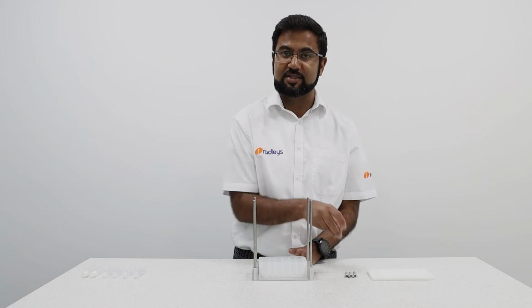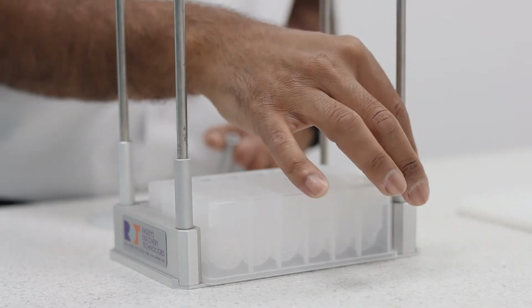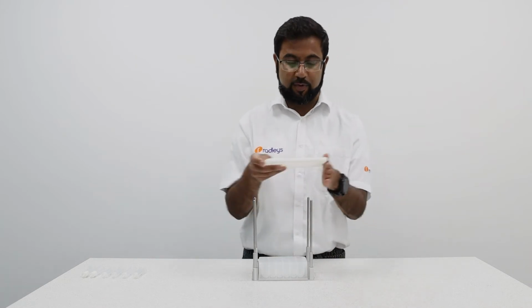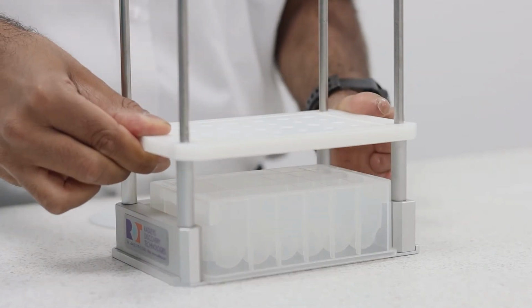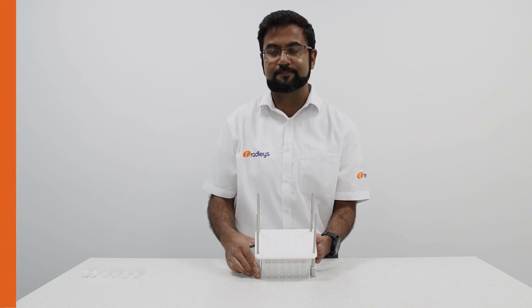The next step is to select the correct size aluminium spacers depending on your collection platform. If you're using a microtiter plate, the short aluminium spacers will do. Once they're in place, then place on your support plate. When you put on your support plate, please ensure that your silicon gasket is facing upwards.